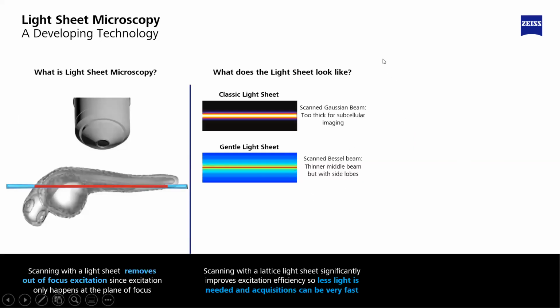Okay, well, this is great, but what's really so special about the lattice light sheet in particular, in comparison to your standard traditional light sheet microscopy? Well, there are a few notable forms of light sheets that have different attributes and benefits to them.